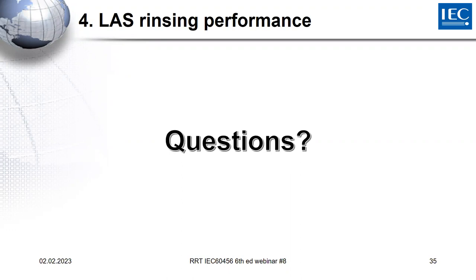Yes, Dorota. Hi, I have a question. During your presentation, we can see that we should use a 500 milliliter volumetric bottle. Yes. For each sample, you need 500 milliliters. We cannot shake with, for example, only 100 milliliters of distilled water on the shaker. It really must be 500 milliliters. Yeah, 500 milliliters for five swatches. For five swatches, so yes.